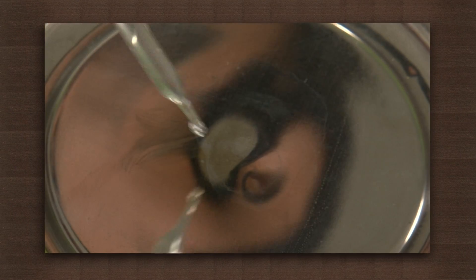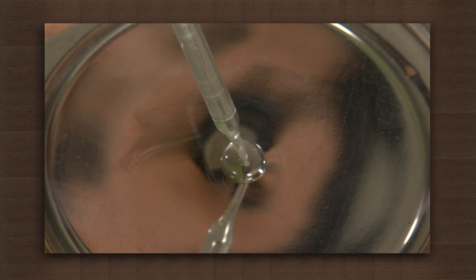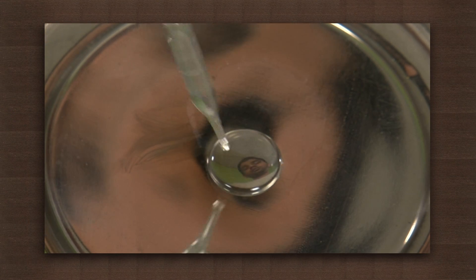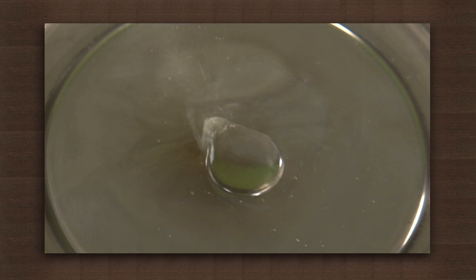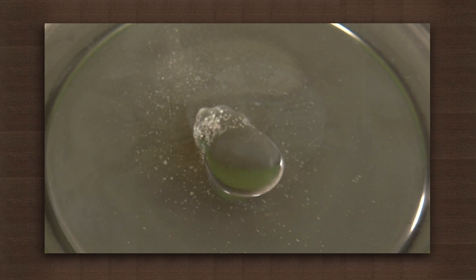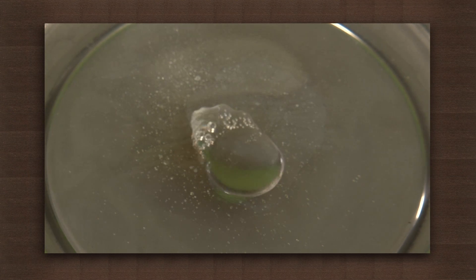Now take a few drops of salt water in the plate, heat it, and you will see that salt is left behind when the water evaporates.